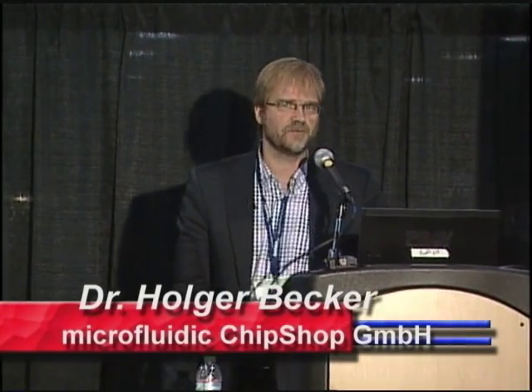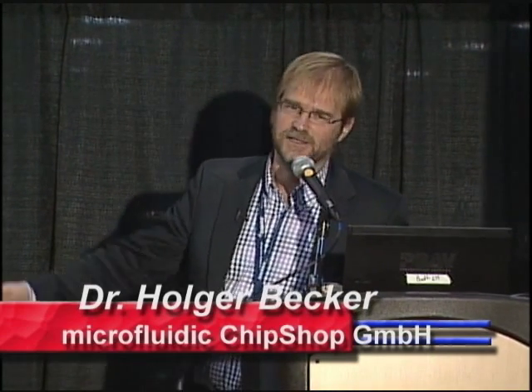I'm from a company called Microfluidic ChipShop, and I'm going to talk about microfluidics today. And I thought this makes a much nicer slide to start off with than my boring official title. That's actually my boring official title. Microfluidics is a powerful technology for diagnostics and medical product development. And I hope you're somewhat familiar with microfluidics. Other than that, I will give you a brief introduction of what all this is about.